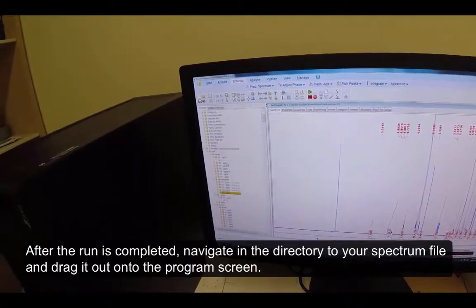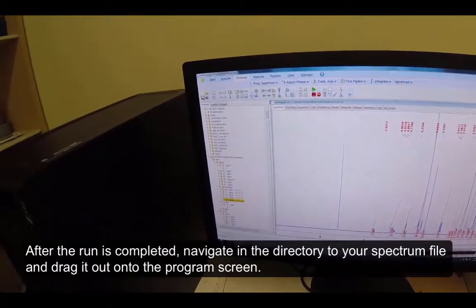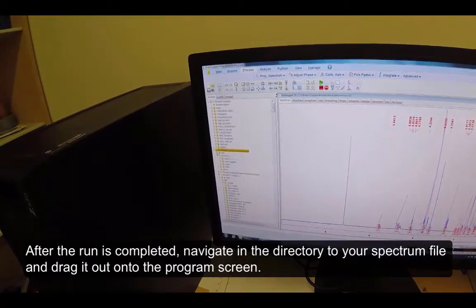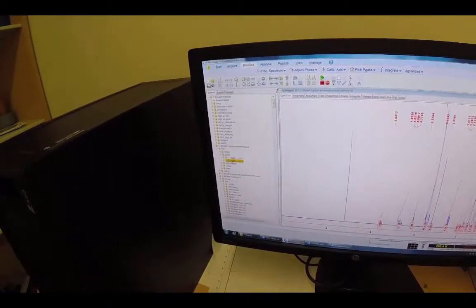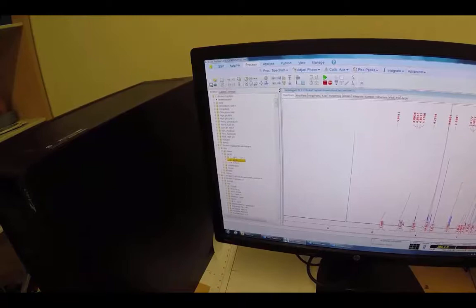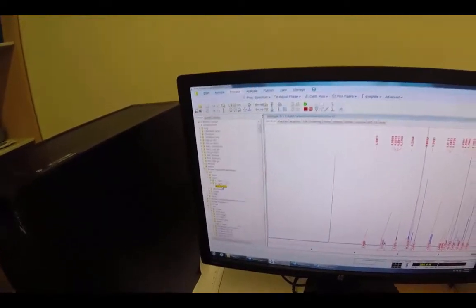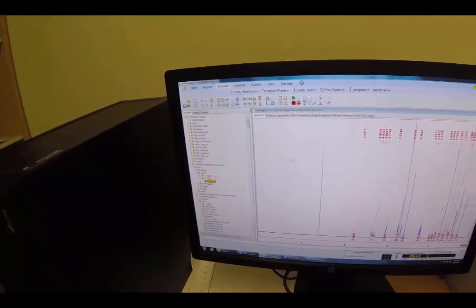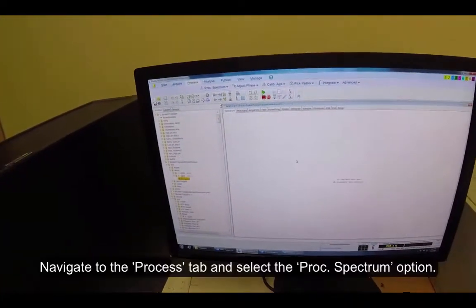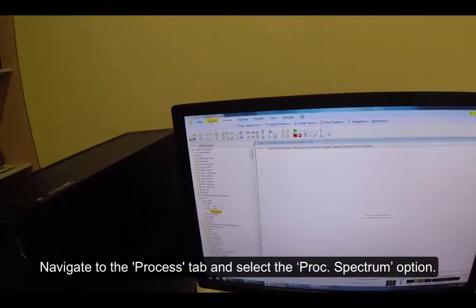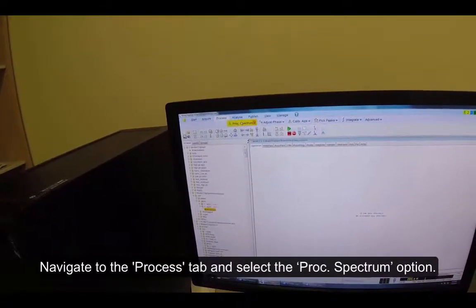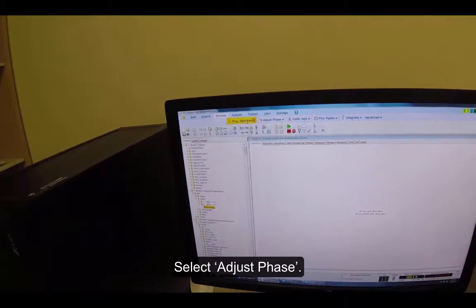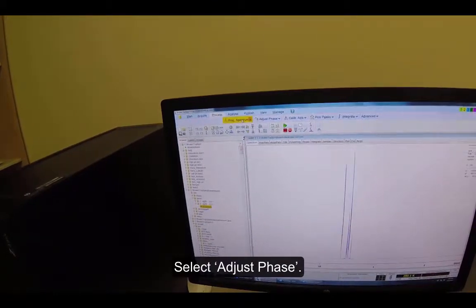After the run is completed, navigate in the directory to your spectrum file and drag it out onto the program screen. Navigate to the Process tab and select the Process Spectrum option. Select Adjust Phase.